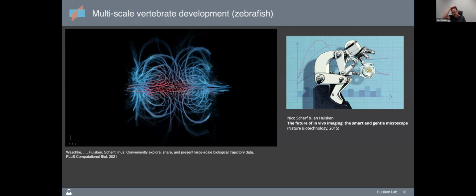So this is really also important for future developments, where we think a lot about these smart microscopes, where you essentially have to inspect the data in real time automatically to make choices whether you want to continue the experiment, you may want to change your area of interest, your region of interest, you may want to change the magnification, being able to zoom into particular portions of the image to be able to record more information and less overhead, and reducing effectively the amount of data that you're collecting.